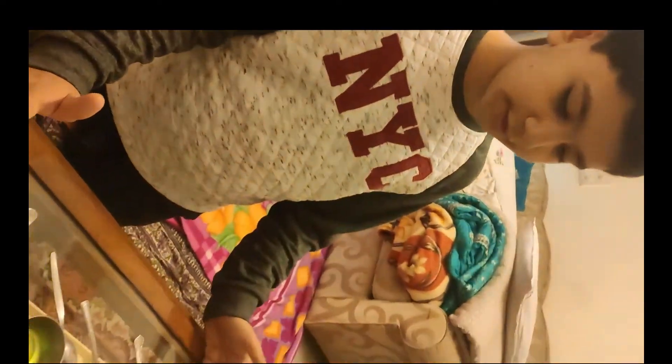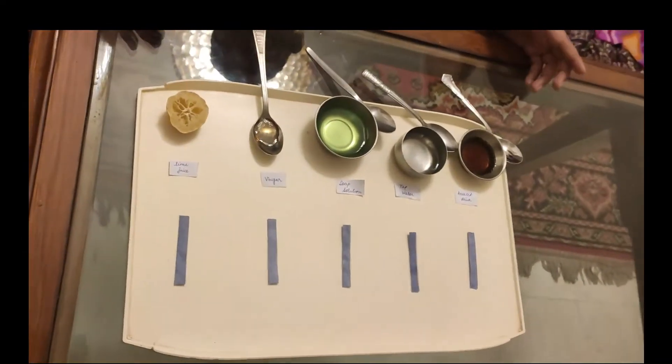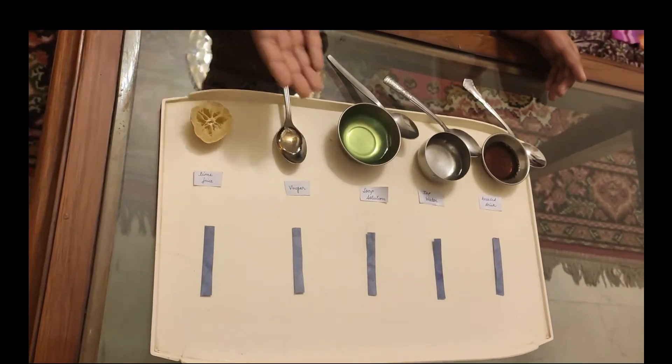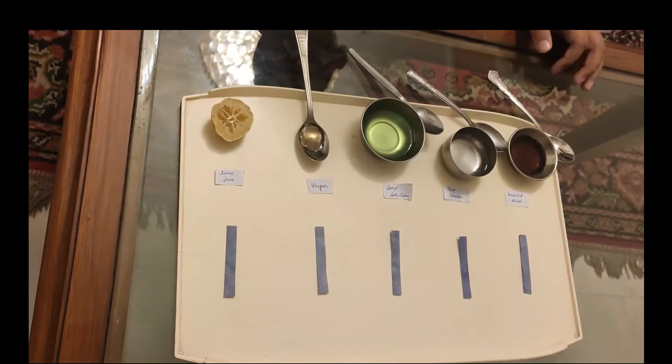Let's see what happens. Here we have a litmus test of five household items. I will pour each of these five household items one by one on these five litmus papers.